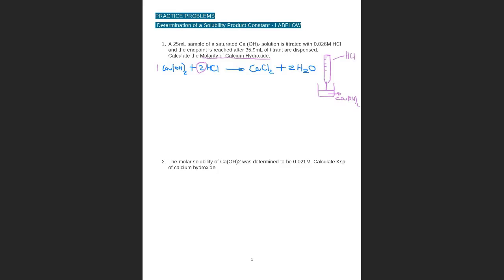And here you have 2 or 3 drops of the indicator. In this case, it is methyl orange.